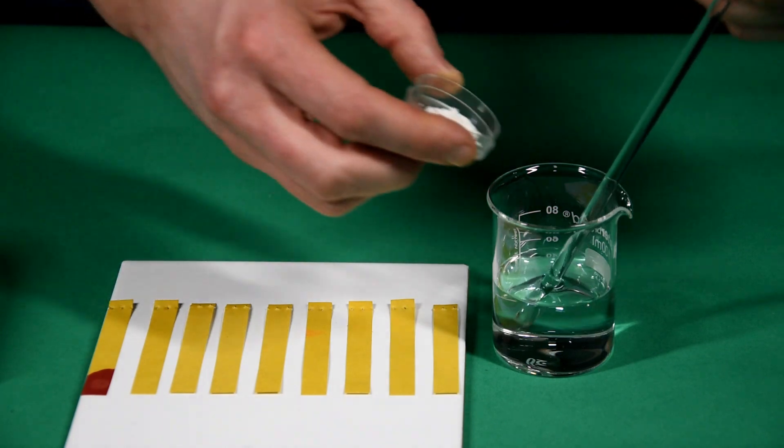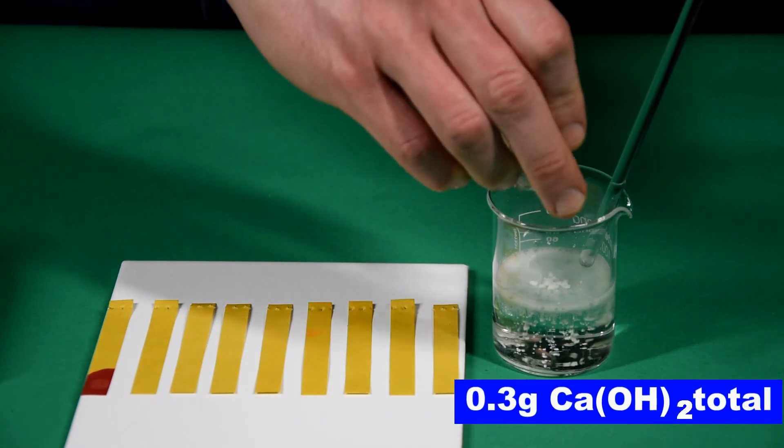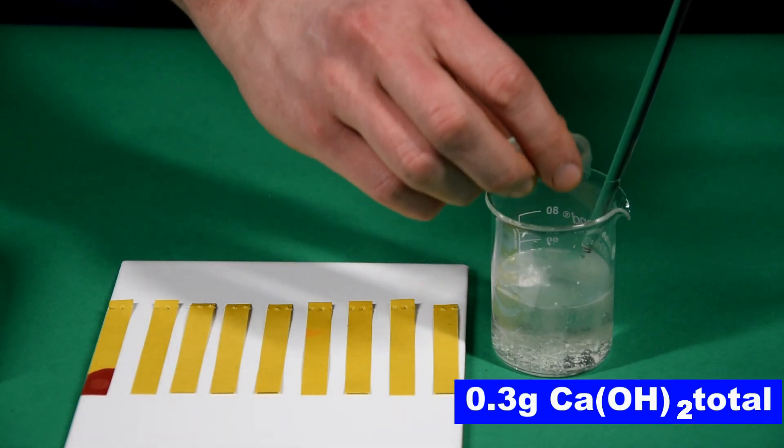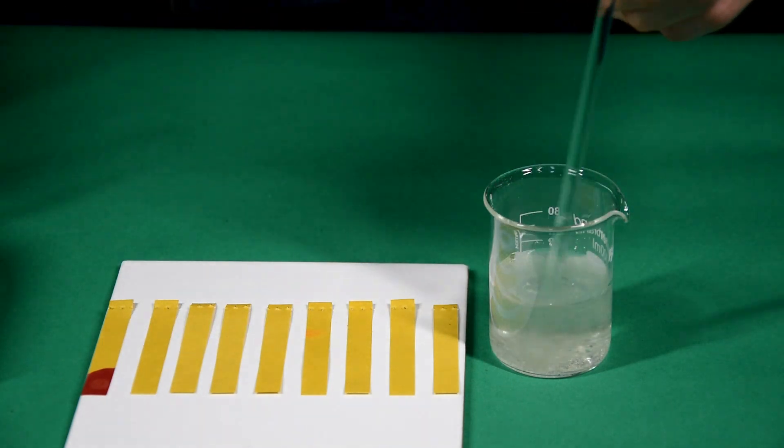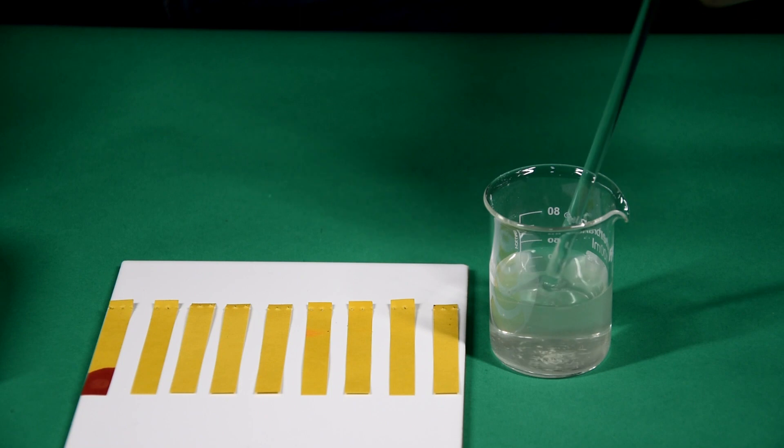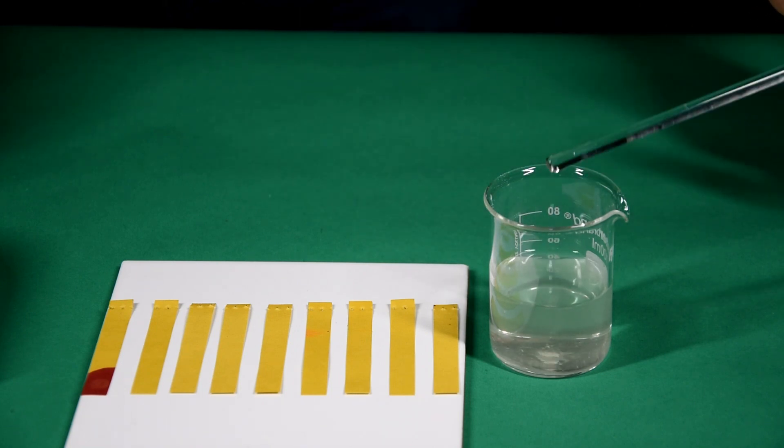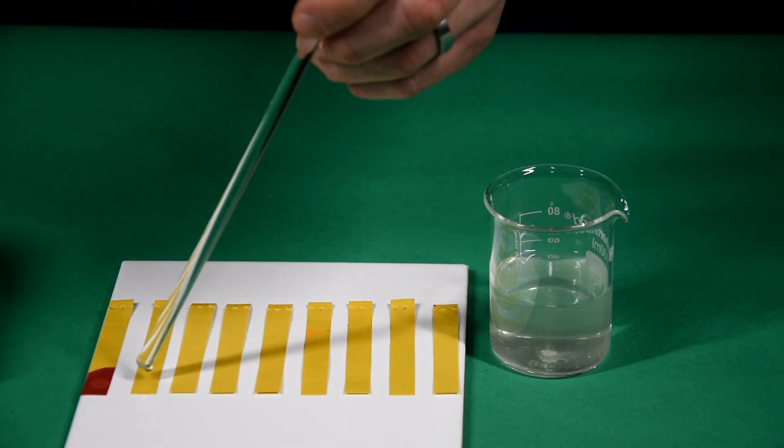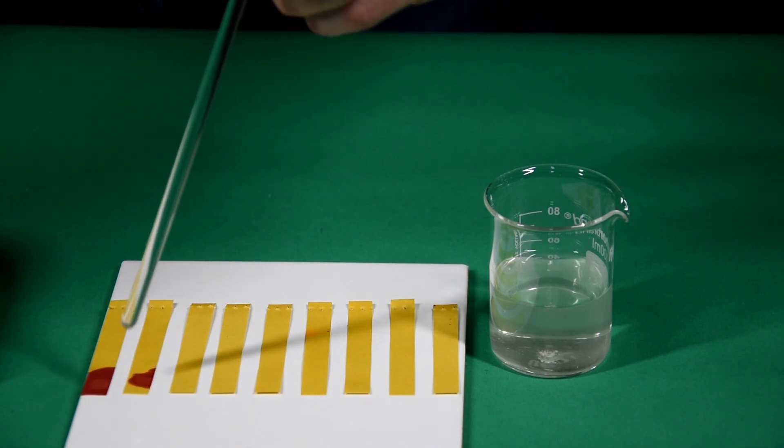Now add 0.3 grams of calcium hydroxide powder. And stir. Use the glass rod to place a drop on the second sheet of paper.